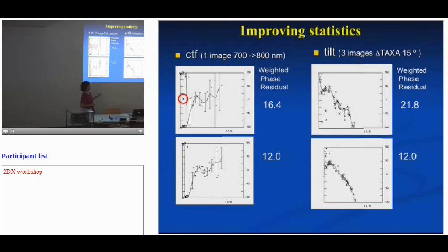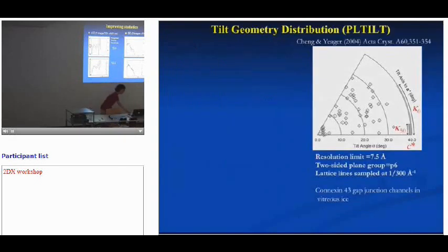Those are pretty big differences once it's tilted. When I corrected those 3, I got my phase residual down by almost 10. So you can see the difference it will make if you have all this error in your merging step and in your CTF determination step. You should use all these numbers to help you improve your image processing.